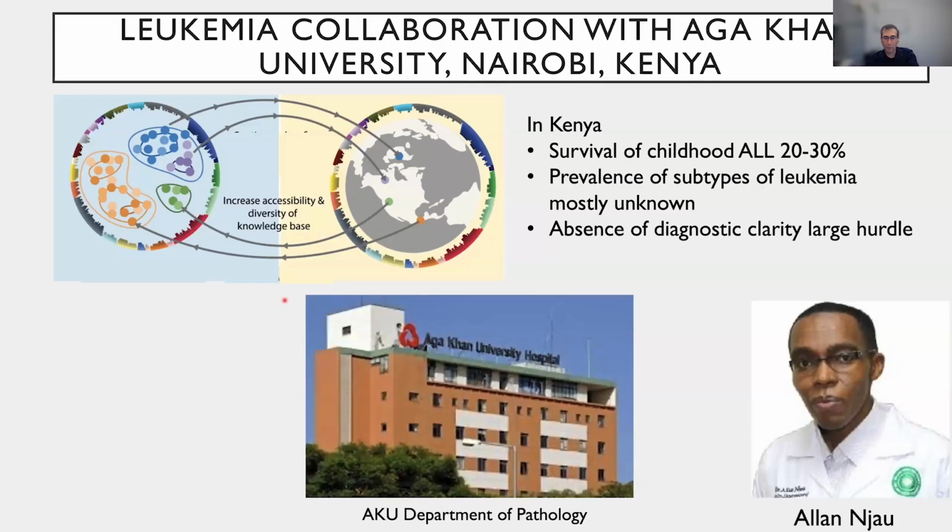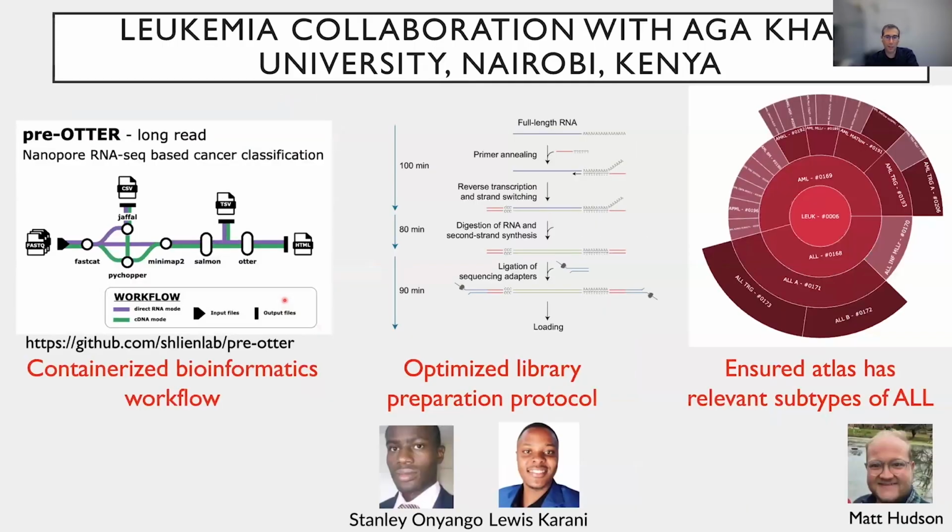And so for this, in collaboration with Alan, we began to investigate using the ONT platform, specifically the MinION that was available at AKU in Nairobi. We started by containerizing a lot of the bioinformatics workflow, which is available and people can use both for Nanopore as well as non-Nanopore purposes. We optimized the library prep protocol, although now with the new release that's been described, this isn't necessary anymore. In fact, the new release does give us a ton more data.